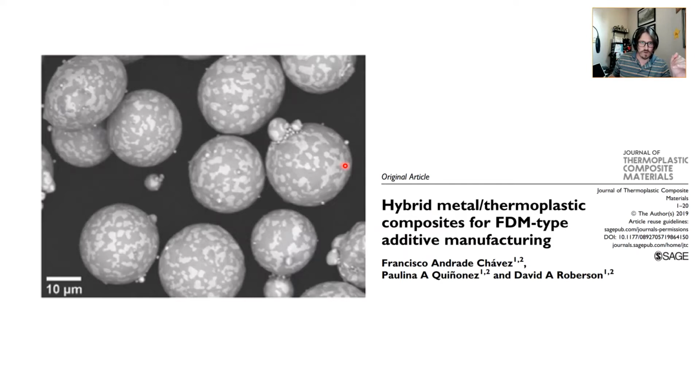This one, no ring around the sphere. The contrast is purely driven by chemistry. That tells us this is a backscattered electron image. So what's important to know when you're looking at electron micrographs is what signal you are looking at. That helps you interpret the data. It's very, very important to know what signal caused which.